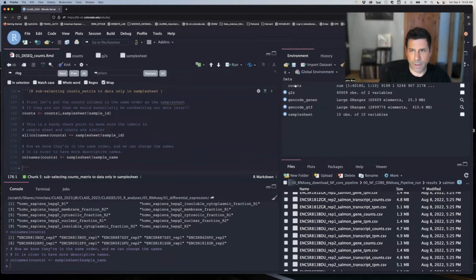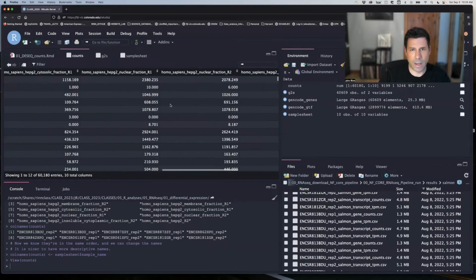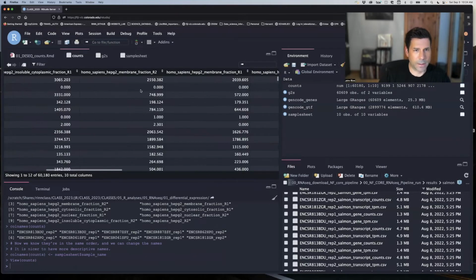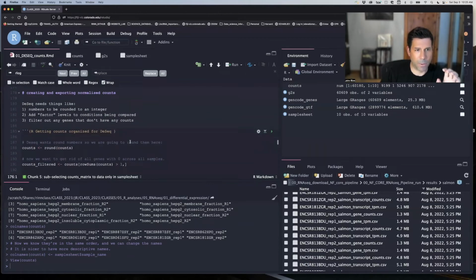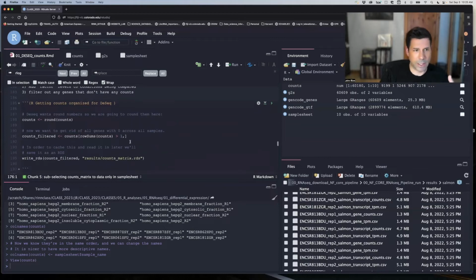So we have our counts object here, which has the type of RNA, the gene name, and the quantification. That's all that we would need, and now we could do DESeq on different comparisons and conditions. What we're going to do first, though, is use DESeq to get out normalized counts. So we're still working in count space here. We are going to get them ready to go into DESeq.